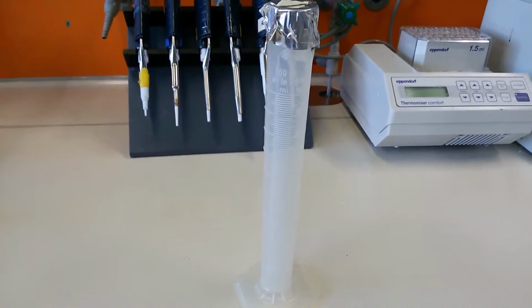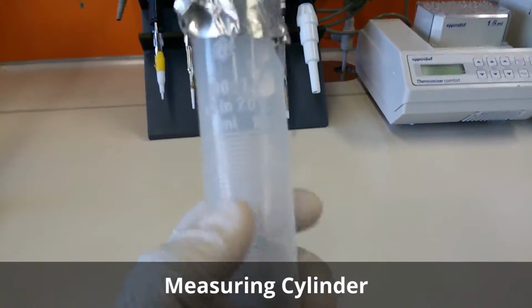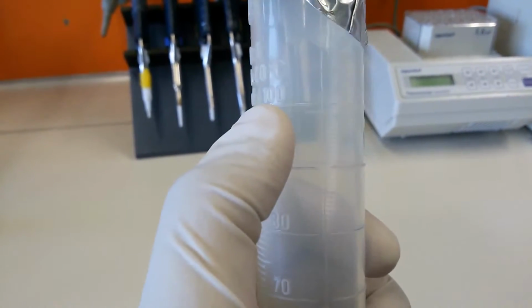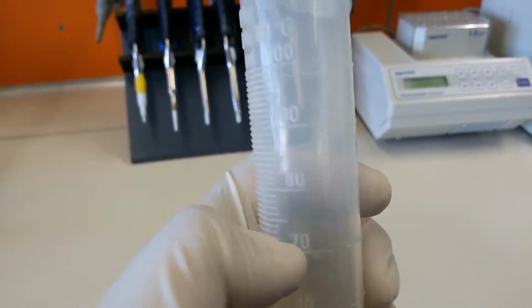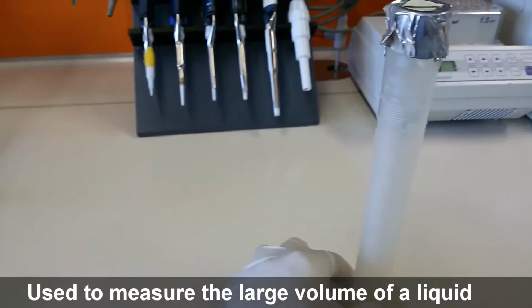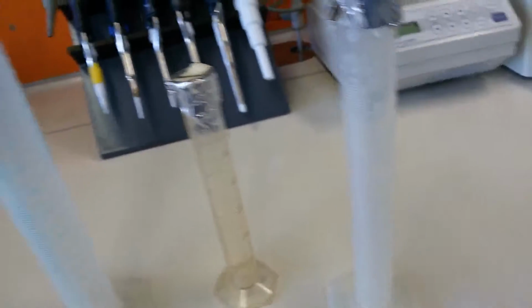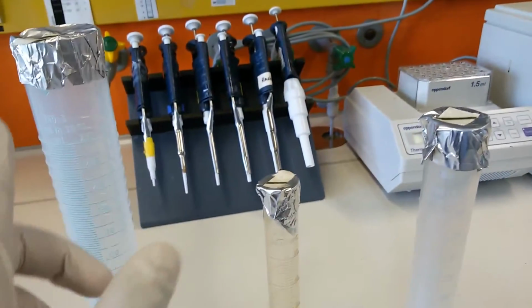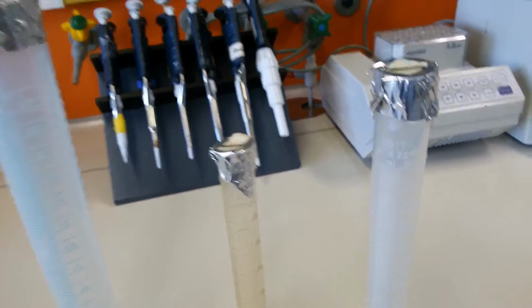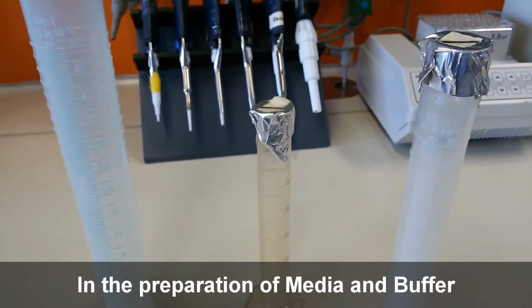The thing that you see in front of you, we call it a measuring cylinder. As you can see, it's a 100 ml measuring cylinder, and here you can see 100, 90, 80, 70. That means a cylinder can measure volume in different volume ranges. Here you see the aluminum foil on the top of them, they're covered, they're sterile, they're not contaminated from inside. So this is a measuring cylinder, and the general operation is very easy.